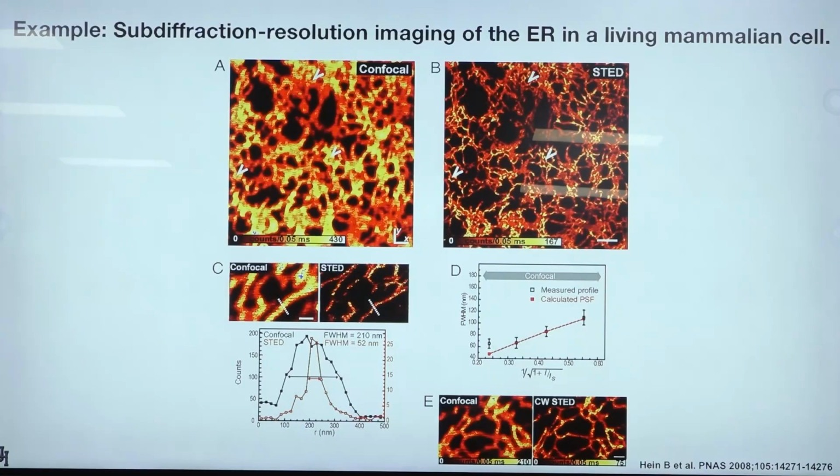Getting the precise alignment between the two beams is very difficult. It's not an easy thing to do, but people have figured out how to do this, and it works remarkably well. In fact, companies now sell instruments of this sort. It's expensive enough that one university may have one or two, and people share it as a shared facility.